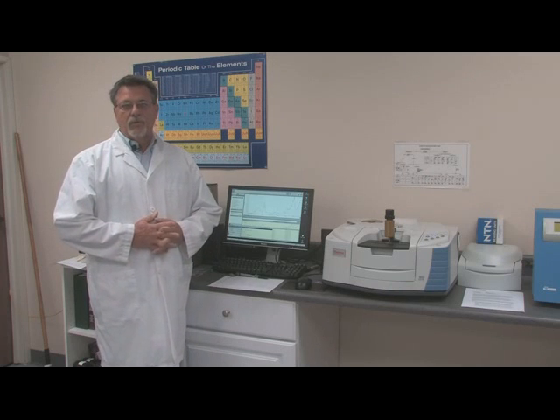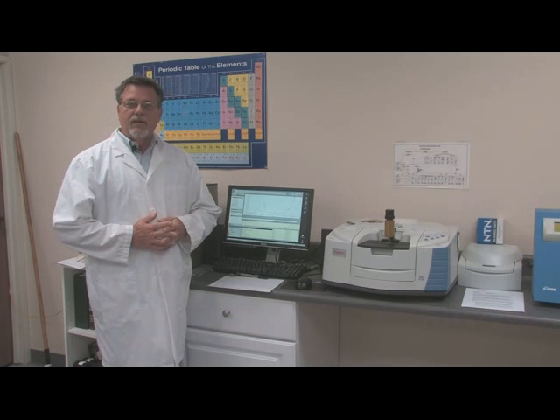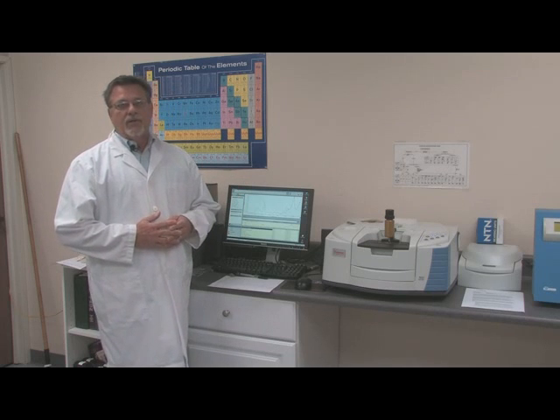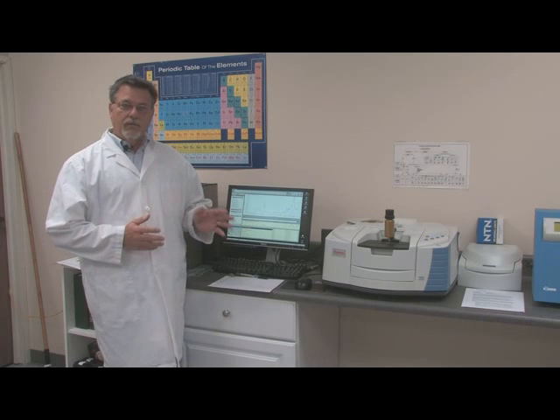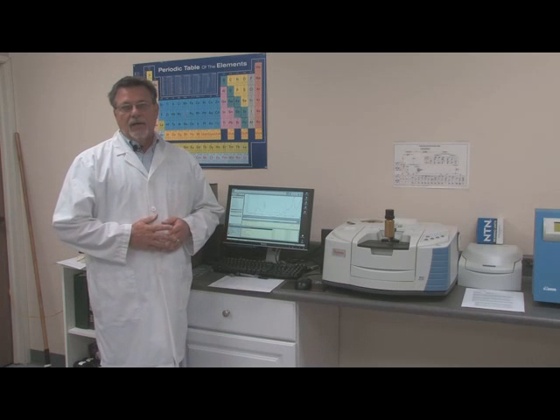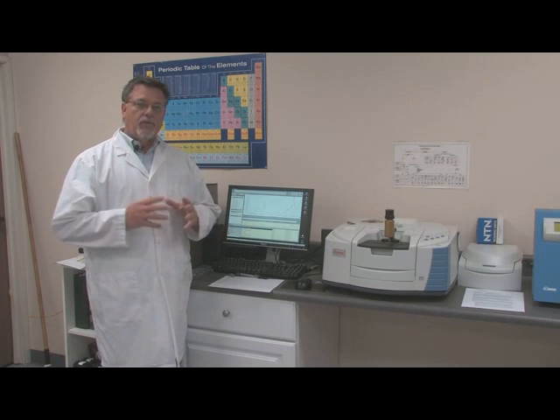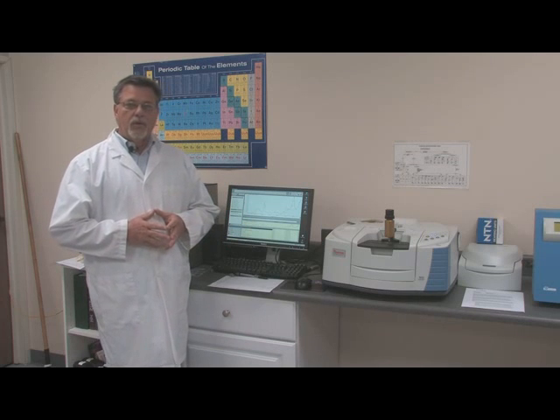You'd be surprised how many times we find that even our customers are getting materials that are not quite to spec. So this machine here has over 19,000 different polymers and elastomers listed on it, and so it gives us the ability to take a look at the footprint, the infrared footprint of a material, and identify exactly what it is, or bring it into a very, very close spectrum of what it might be.